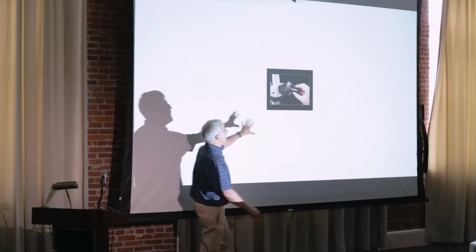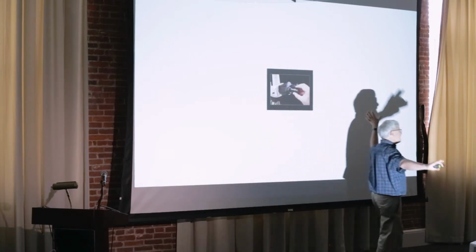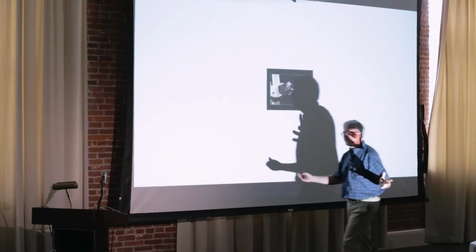Well, maybe not all of us, but lots of us used to shoot slide film, and we had a big light box, and you would take your slide and put it on the light box. So here, let's put a slide on the light box. You're looking at the slide on the light box, and all this light is getting in your eyes. Oh my goodness, I can't see anything. So it's difficult to see.